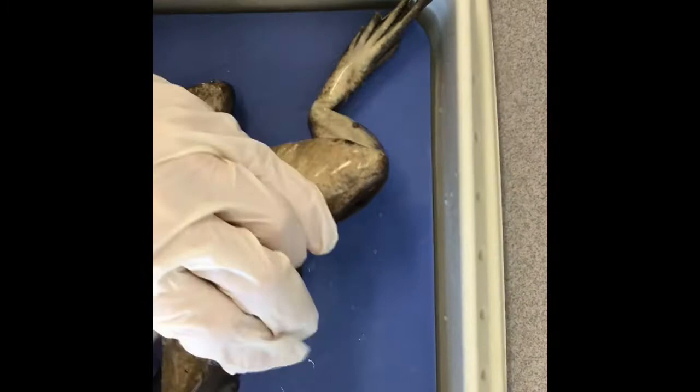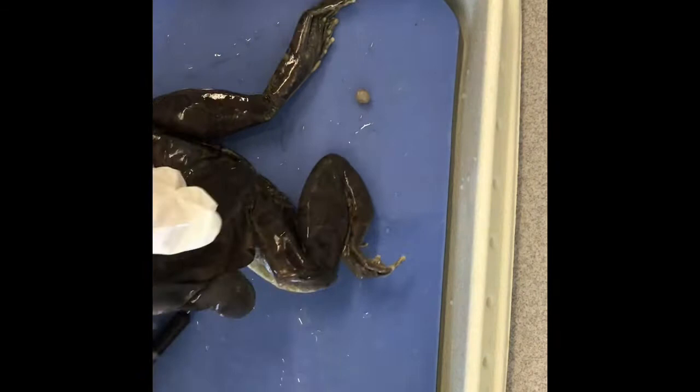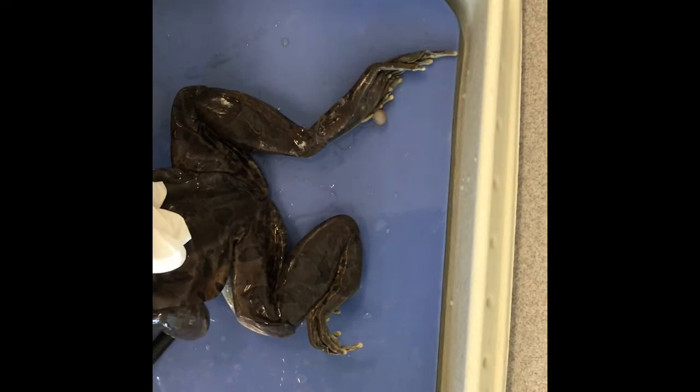We're going to open up the mouth of the frog. Sometimes you have to cut into the jaw in order to open the mouth wide — cut the jawbone on either side.